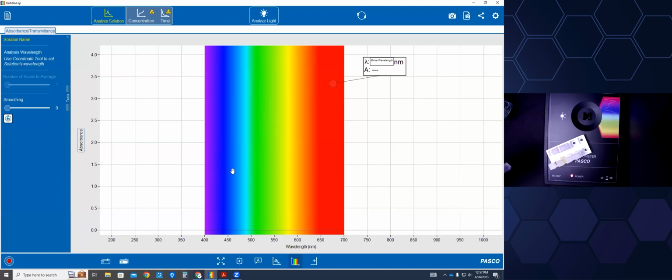And I just realized right now that when I was showing you the chlorophyll from the spinach, I had forgotten to say something important. I should have recalibrated with ethanol, because ethanol was my solvent. Oops, I forgot to calibrate with my ethanol solvent. I still got the right pattern of data, but it would have been even more accurate if I had recalibrated with my ethanol solvent. And that will happen again where I have to recalibrate, and I'll show it. So again, every time you have a new solvent, you have to recalibrate.